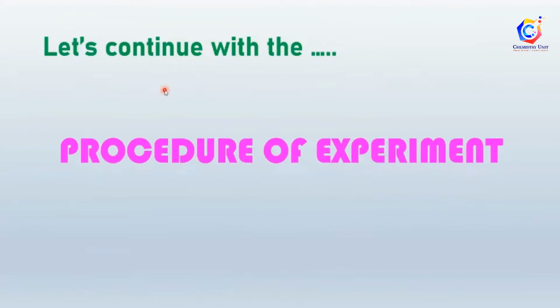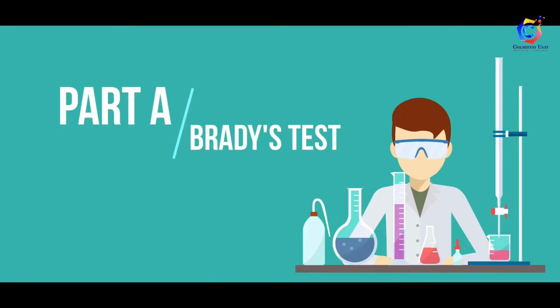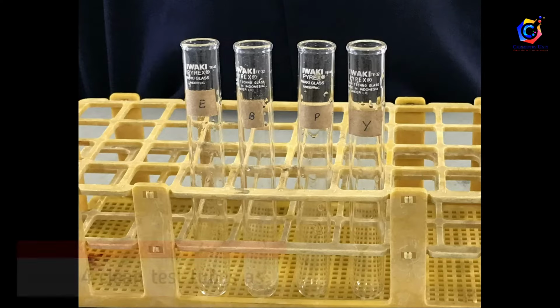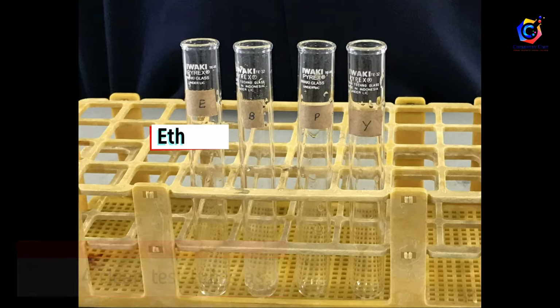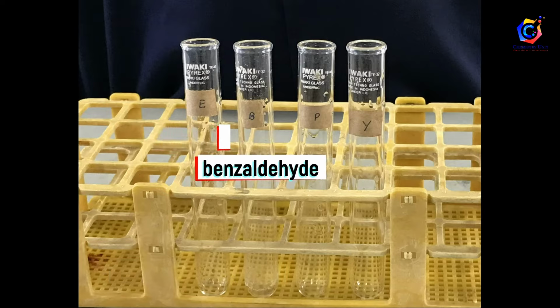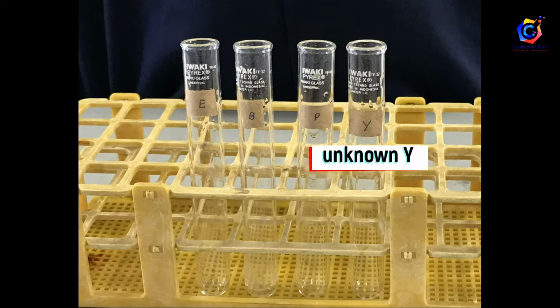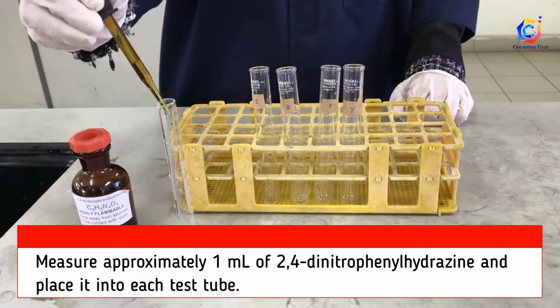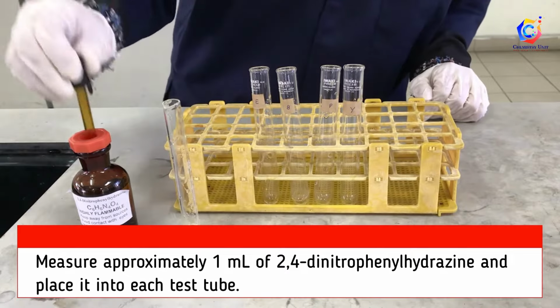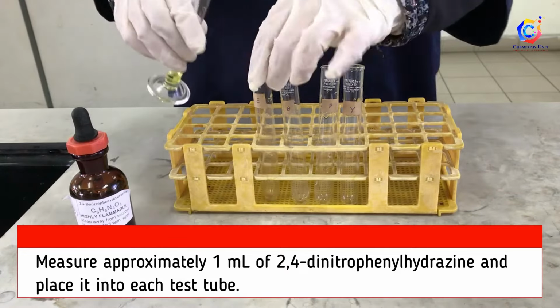Now let us continue with the procedure of the experiment. Part A. Brady's test. Label 4 clean test tubes as ethanol, benzaldehyde, propanone, and unknown Y. Measure approximately 1 ml of 2,4-dinitrophenylhydrazine and place it into each test tube.